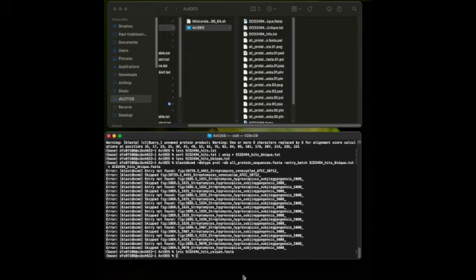So once you have your list of hits from the BLAST sequence and you've pulled them with their accession number and name and the sequence of the proteins that you're interested in, it's at this stage that you can then use the muscle program in Python to align this.